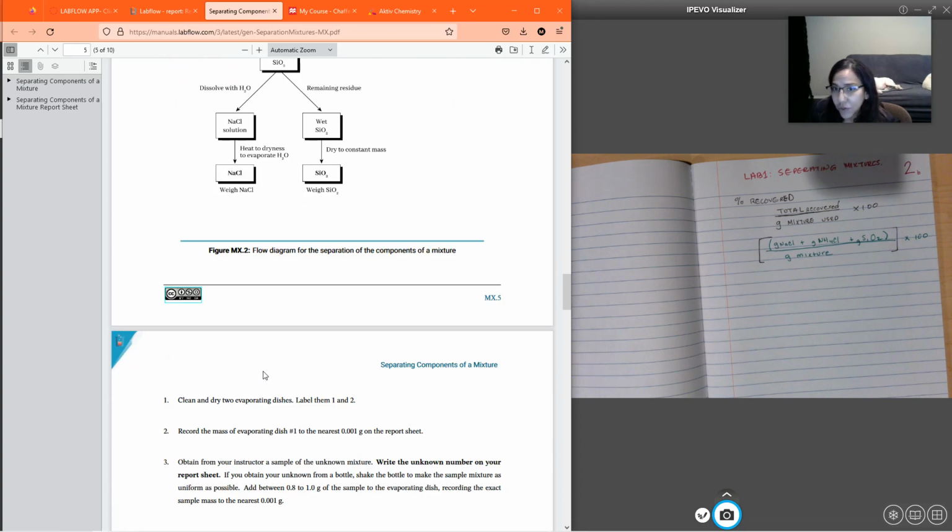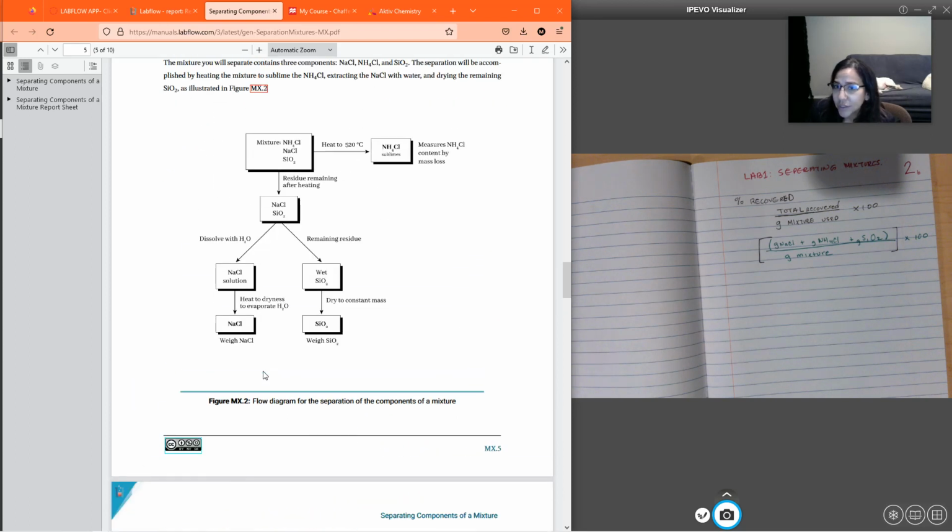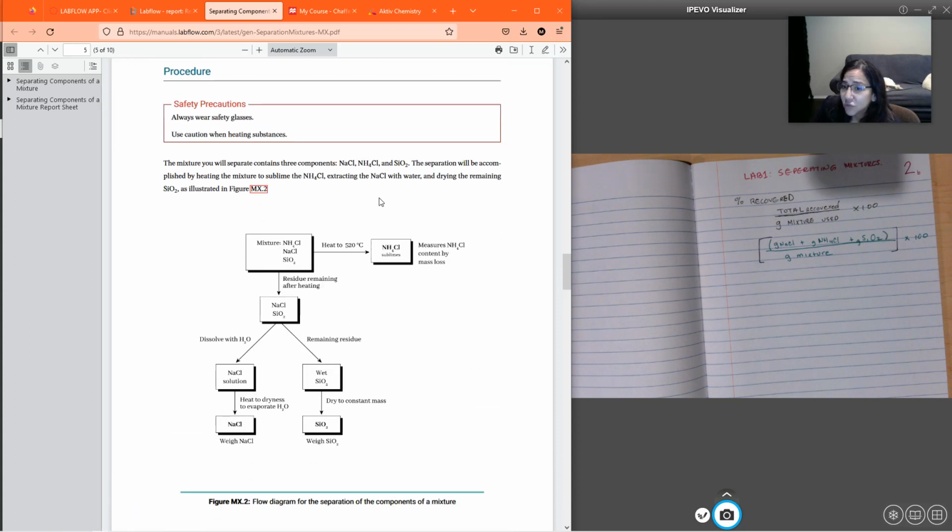Feel free to go over the little chart here, this illustration on how drying something, what do you have left? There are questions on your lab at the end of it that are going to be related to this, right? If something is still wet, what might you have gotten? If something dried, what did you get instead? Those kinds of things. So reference this page right here.